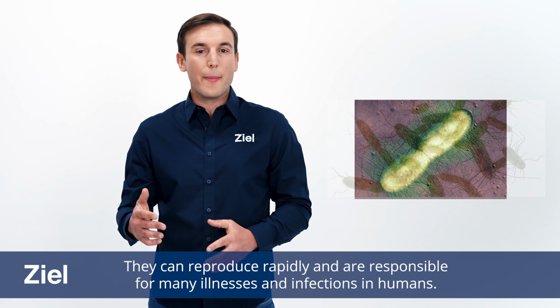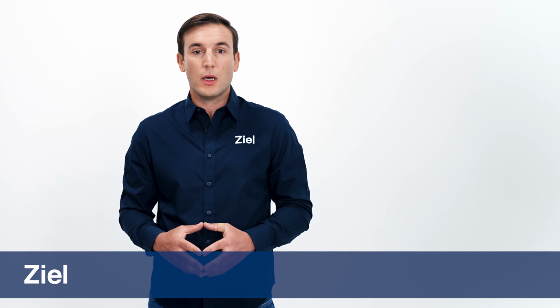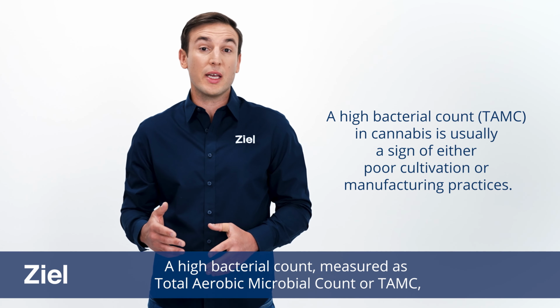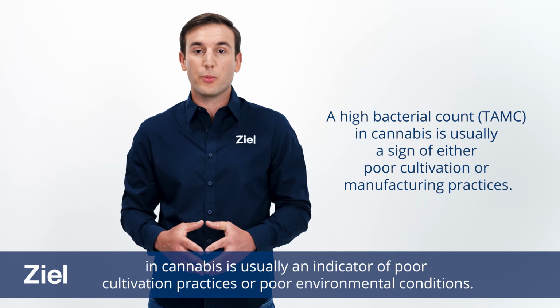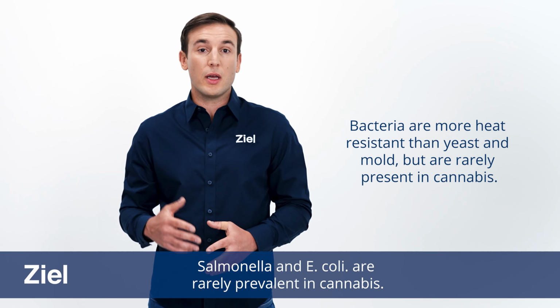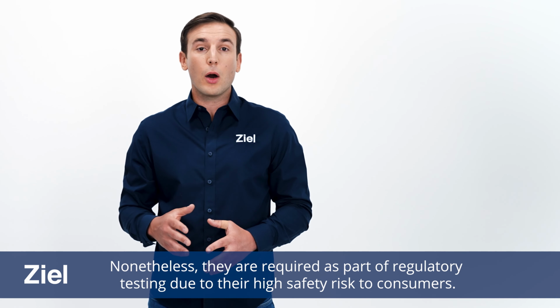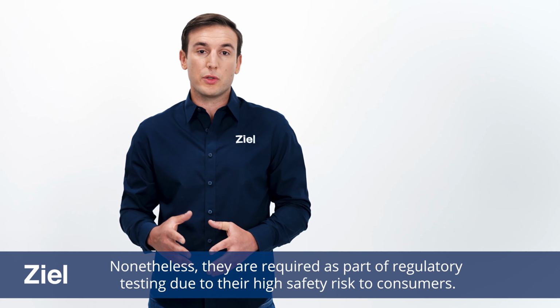Bacteria are another type of single-celled organism. They can reproduce rapidly and are responsible for many illnesses and infections in humans. A high bacterial count, measured as total aerobic microbial count, or TAMC, in cannabis is usually an indicator of poor cultivation practices or poor environmental conditions. Bacteria are more heat-resistant than yeast and mold. Salmonella and E. coli are rarely prevalent in cannabis. Nonetheless, they are required as part of the regulatory testing due to their high safety risk to consumers.